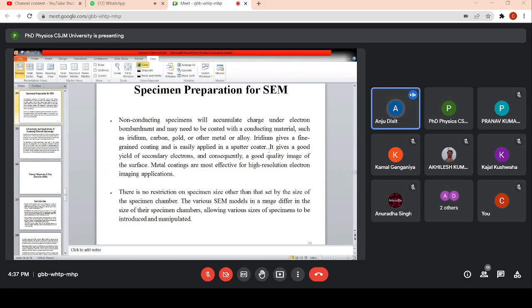तो डीसी स्पटरिंग यूनिट वहीं पर आपकी यूनिट रहती है एसोसिएटेड सेम सिस्टम के साथ, जिसकी हेल्प से आप अपने जिस भी मटेरियल का आपको सेम करना है उसके ऊपर आप मेटेलिक लेयर की कोटिंग कर सकते हैं. So it gives a good yield of secondary electrons and consequently a good quality image of the surface. So metal coatings are more effective for high resolution इलेक्ट्रॉन इमेजिंग एप्लीकेशन. तो इसमें जो इमेज की जो क्वालिटी है इन टर्म्स ऑफ रेजोल्यूशन वो भी इंक्रीज करती है.